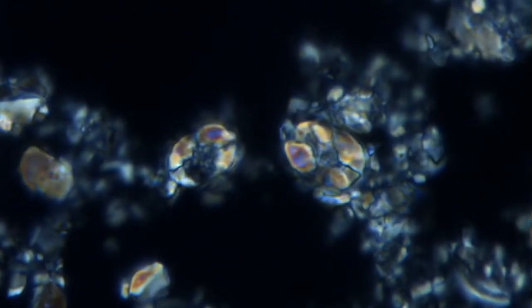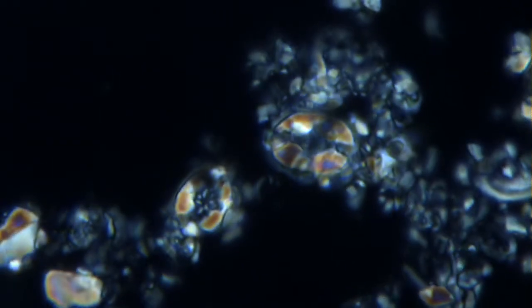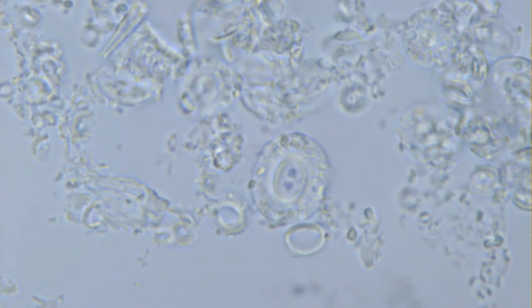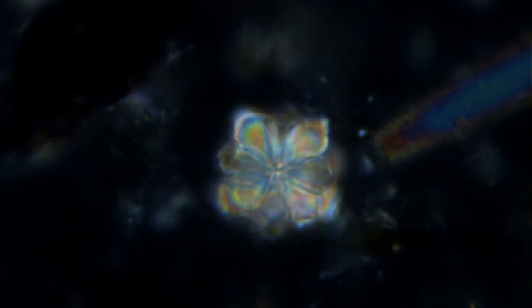And what about the colors we see on calcareous nanofossils under cross polars? Are they the real colors of the crystals? No, they're not. The real color of a crystal can only be observed using parallel polars, which means only with the polarizer inserted. Normally, calcareous nanofossils have whitish colors, but sometimes, especially if they are very thick or recrystallized, they can be yellow, orange, red, or even blue, like in this element of an ascidian spicule.